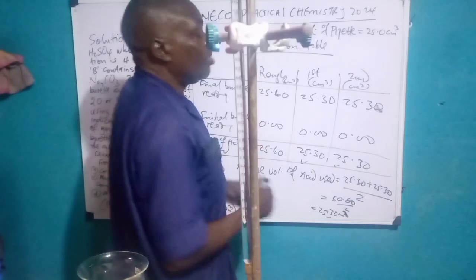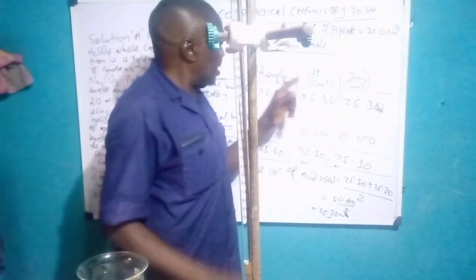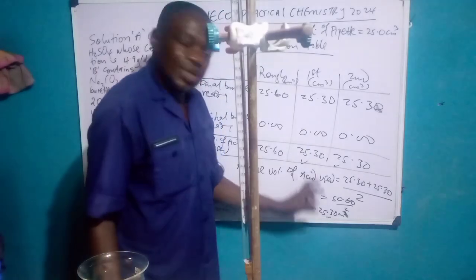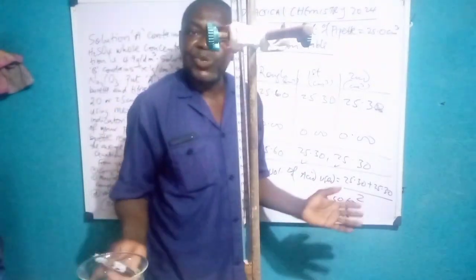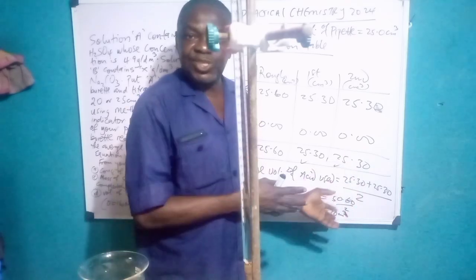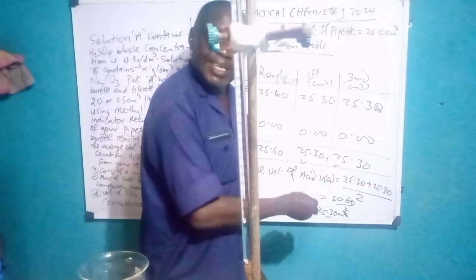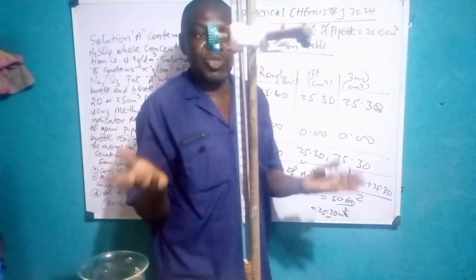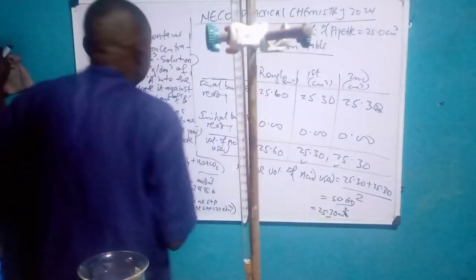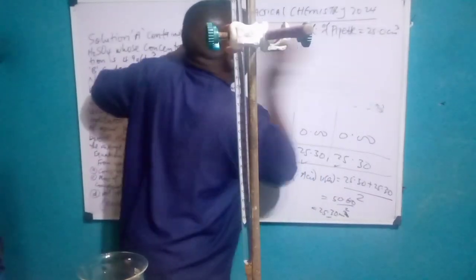A similar table. Remember, in your school, most people give out their endpoints. In this case, you cannot copy what I have here. This is a teaching class. It's meant to enlighten you on how to carry out titration, so that you know the processes involved, not to take the endpoint. Endpoints of different schools differ depending on what you have in your school. That is how it goes. So we'll now clean it and start the calculations properly.